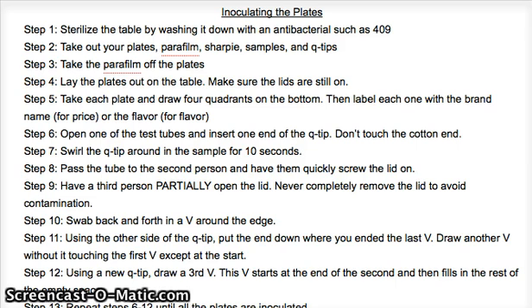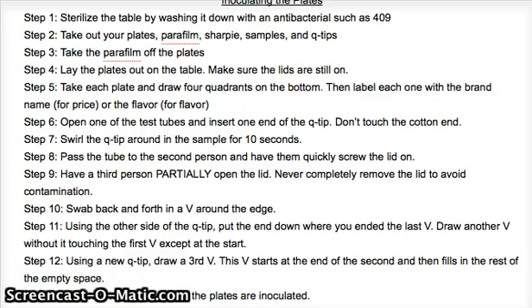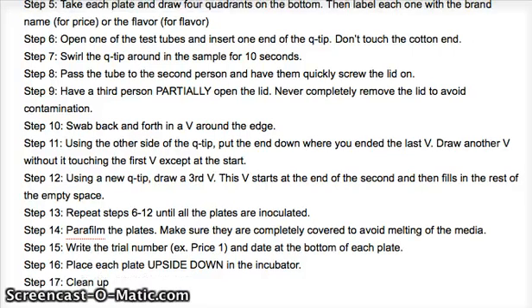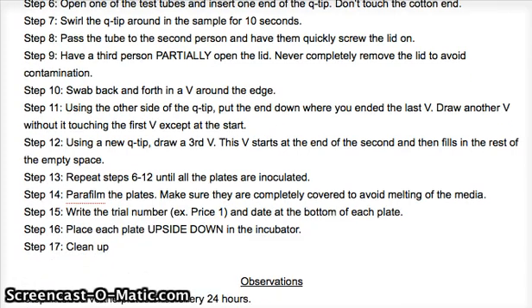To inoculate your plates, first sterilize the table to make sure nothing contaminates your plates. Take out your materials and lay them in your sterile environment. Take your parafilm off the plates, then lay the plates out on the table with the lid still on. Take each plate and draw four quadrants on the bottom — make sure it's on the bottom because if it's on the top, the lid will move. Label each quadrant with the name of the brand or flavor. Open one test tube and insert one end of the Q-tip; don't touch the cotton end because you'll contaminate it.